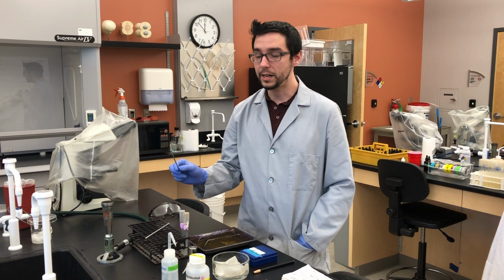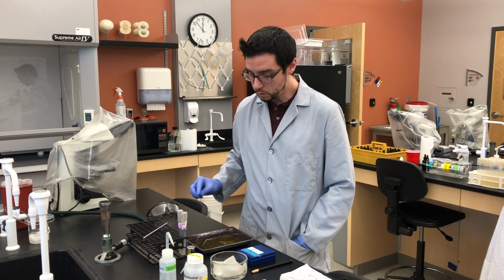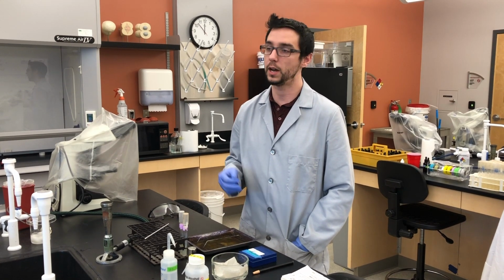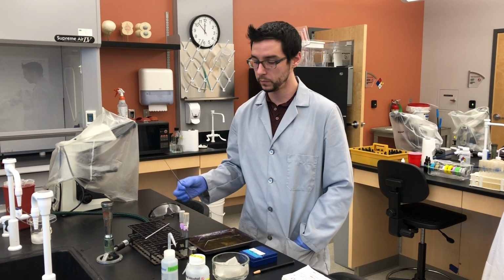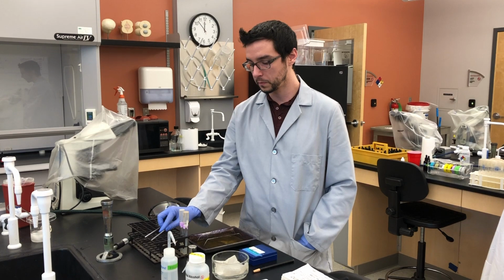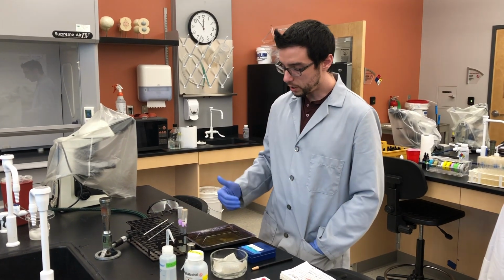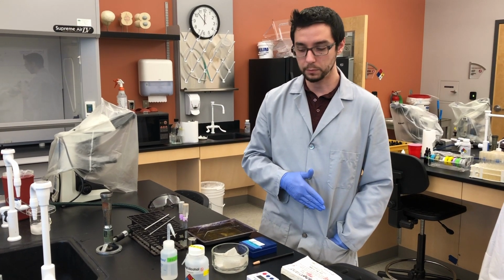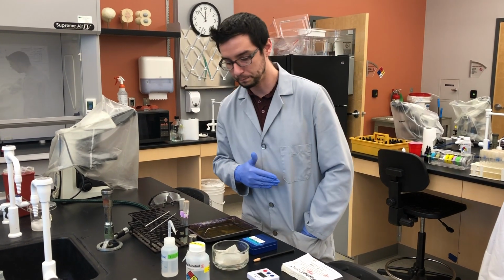The reason for that is they are extremely sticky, and if you do not take the time to spread them around, you're only going to visualize a giant clump and you're not going to have anything worthwhile imaging. So make sure you spread them around. Okay? Once you get your smear dried and heat fixed, then we get to the actual stain process, which we're going to show you here in this video.